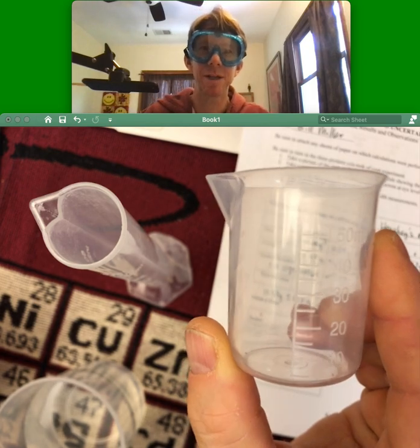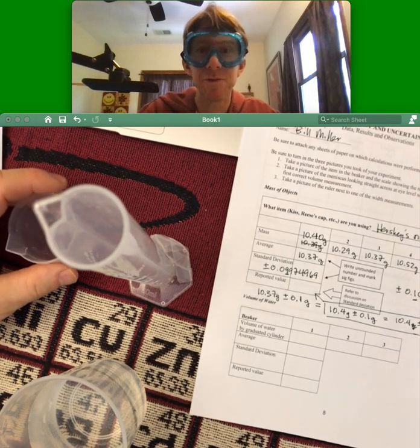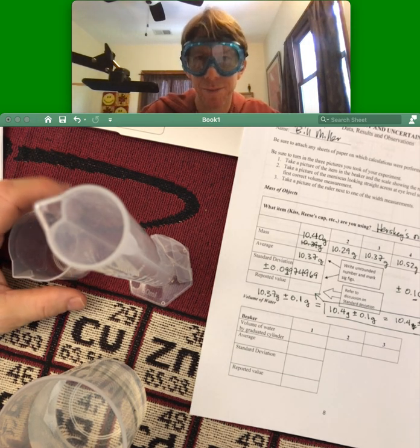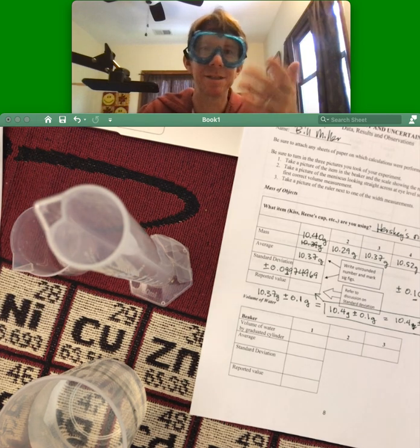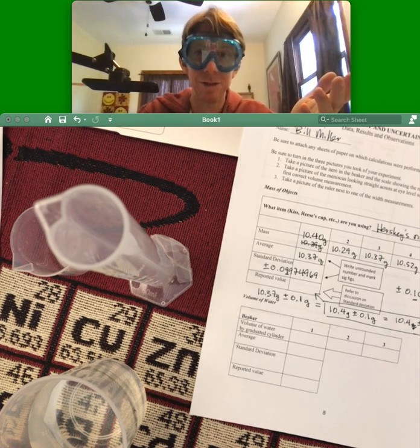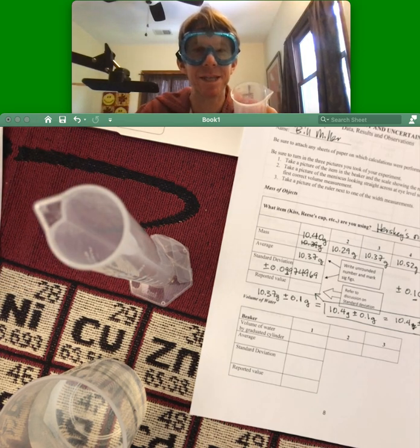If we were to go by the one-tenth rule, that means that it would be 0.5 milliliters. And 0.5 milliliter is not a round number. So we will, because if you put a tenth space, it's going to mean your measurement is going to think that you're accurate to the tenth space, which we are not.